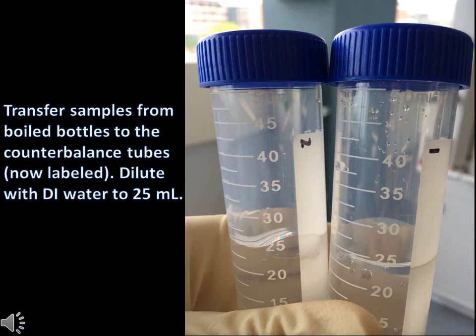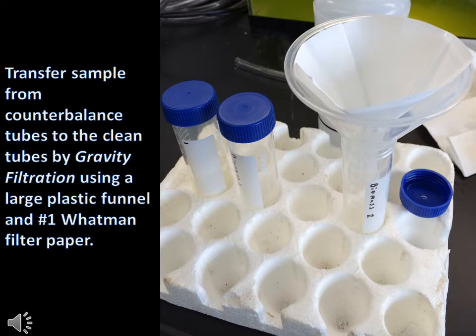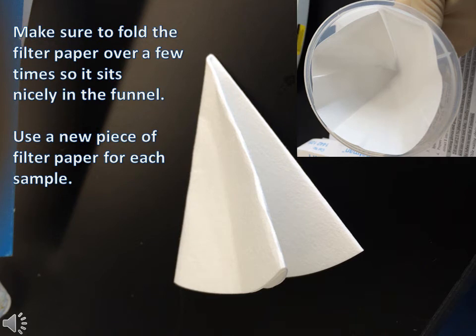Transfer the reboiled supernatant into a 25ml Erlenmeyer flask or something similar that can be diluted with DI water to 25ml. Transfer the diluted supernatant to new test tubes through gravity filtration by using a plastic funnel and Whatman number 1 filter paper. Make sure to fold the filter paper over a few times so that it sits nicely in the funnel.